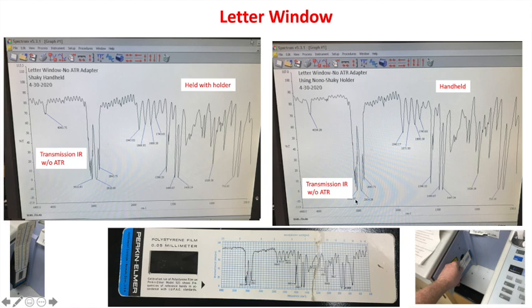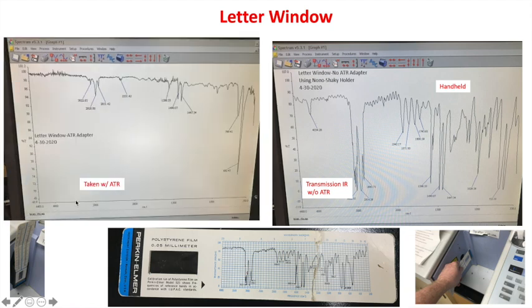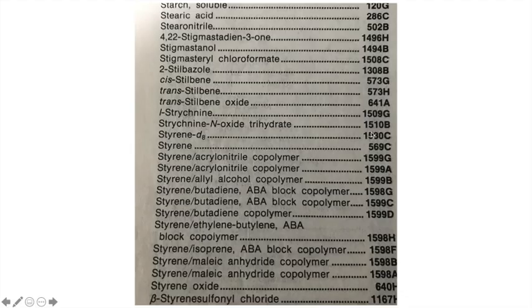See the peaks just over 3000, just under 3000, aromatic overtones. I'm looking for some. We've got an extra signal here at about 4034, and they don't. It's interesting. I wonder about that. Let's look into that some more. So once again, here's the transmission IR without the ATR adapter. And this is with the ATR adapter. You can see it's got similar signals, but much stronger, huh?